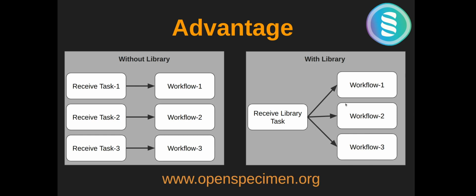This is how libraries reduce the work of creating multiple tasks, and any changes you make in the workflow library will be automatically reflected in all the workflows it is linked with, hence reducing the workload for making changes in each and every workflow.